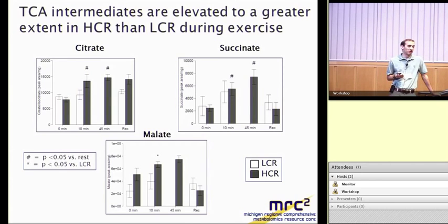One thing that's important to point out here is that depending on how reproducible your system is going to be, you need to consider how many replicates you're going to need, even in targeted metabolomics, to get meaningful data. In this case, we had Ns of 6 or 7 rats per group, and we could have done with even larger N in some circumstances. With cells, sometimes if you have very reproducible, an N of 3 is all you need to see large changes.